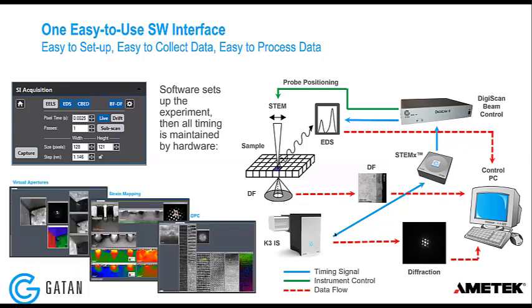Once you have collected your 4D STEM data, you can go into Digital Micrograph, and we have implemented software and workflows in DM for virtual imaging, strain mapping, and DPC.